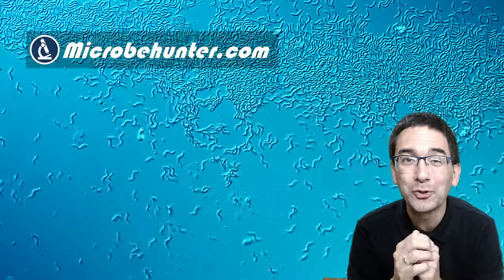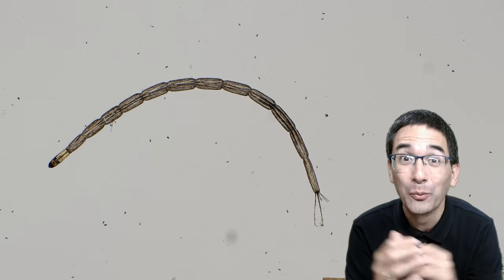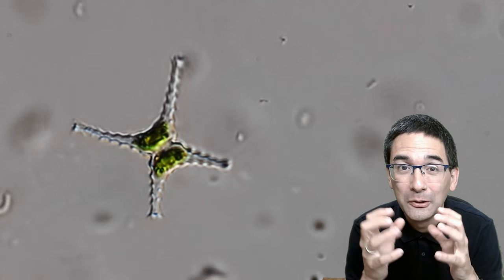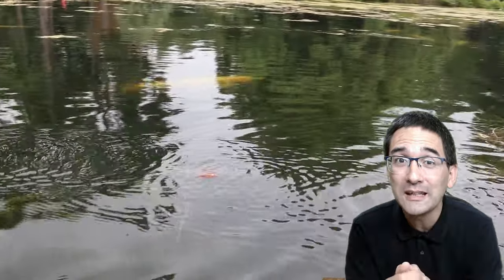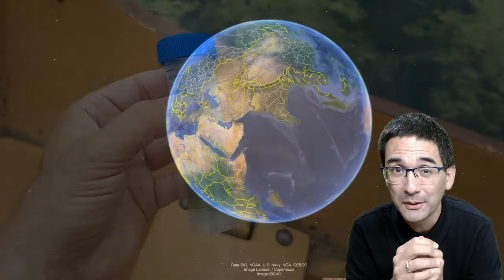Hello and welcome! MicrobeHunter here again, and today I'm going to show you a few beautiful specimens found in a water sample — some microscopic specimens. If you're new to this channel, welcome! I like to put things under the microscope and explore the world by looking at very small things. If you're interested in where I found those specimens, this is the first part of the video, and later on I'll show you what I found under the microscope.